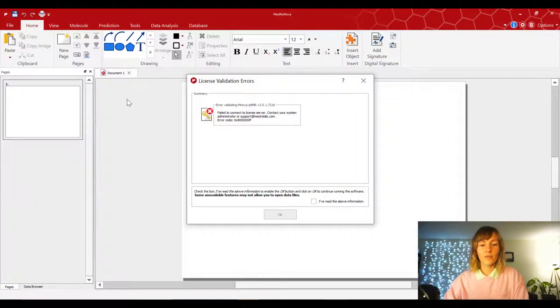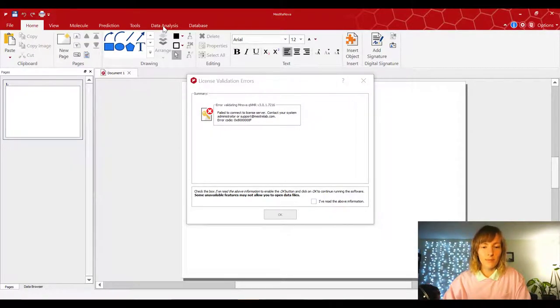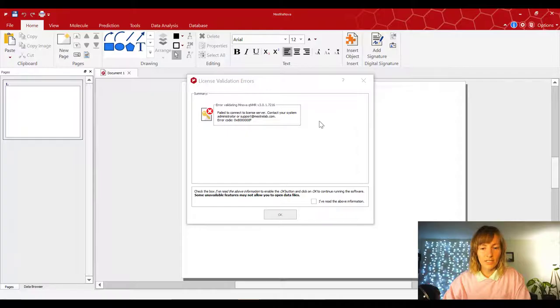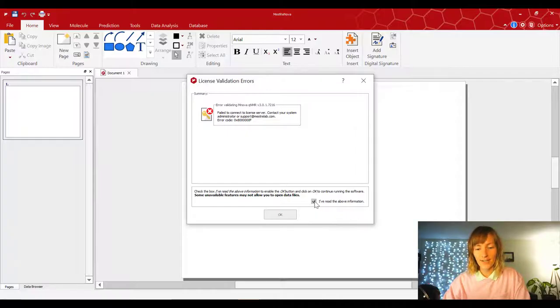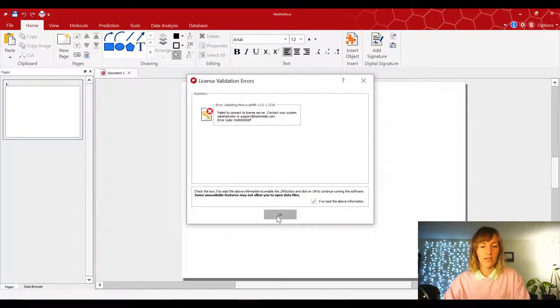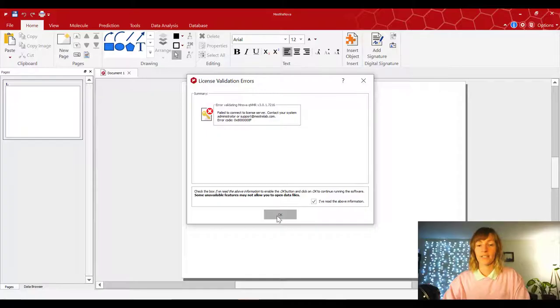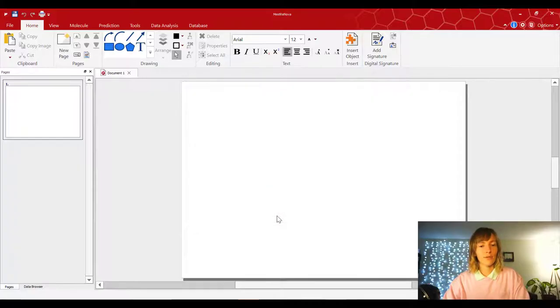Alright, now that your MNOVA software is open, sometimes some of you might be getting this error message. Just select the I've read the above information and click OK. Hopefully that doesn't hamper your ability to actually use this software.